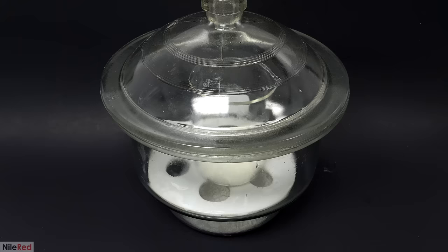However, as we move across the solvents and things get less and less polar, the amount of the B form increases. This causes the color to change, and we eventually get to a very nice violet or blue color. At first glance, this seems like a decent explanation, but there's one major problem with it. It doesn't explain the two major anomalies here, which are the acetic acid and the DMSO. Acetic acid is definitely less polar than water, but color-wise, it looks like it should go before it. The DMSO seems to be placed quite well, but it should actually go just after the water because it's more polar than all the alcohols.